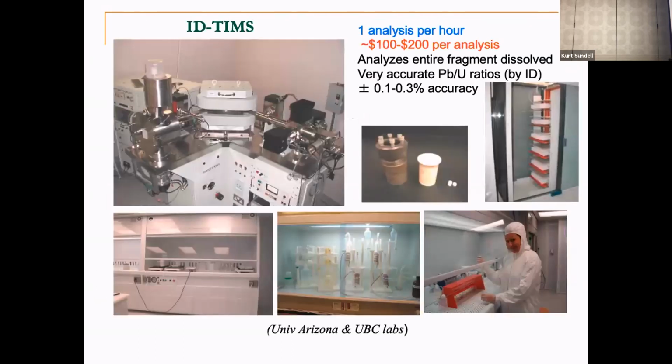So these instruments are super cool. They require a lot of prep work. They're really labor intensive, right? So ahead of time, you're doing a lot of solution chemistry. You work in these clean labs and these silly suits. You can't go put gas in your car on the way to work because that would not be chemically pure enough to go in that lab.